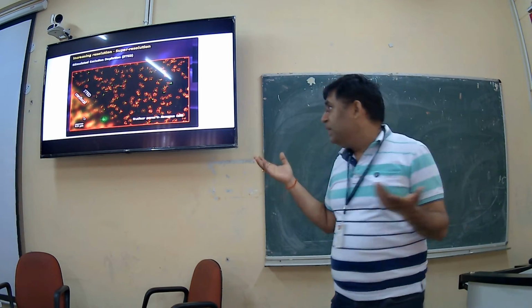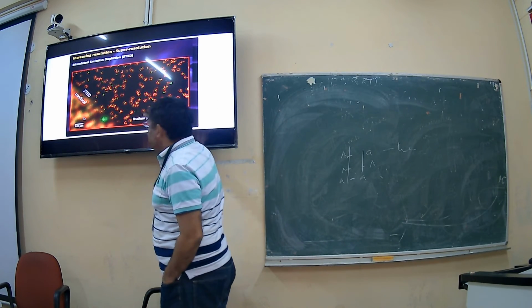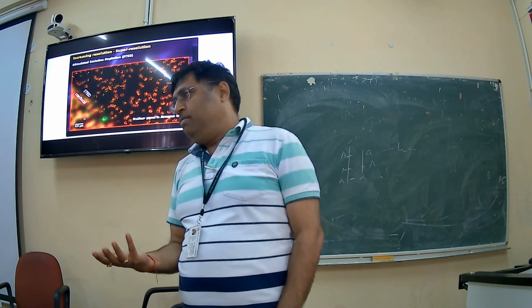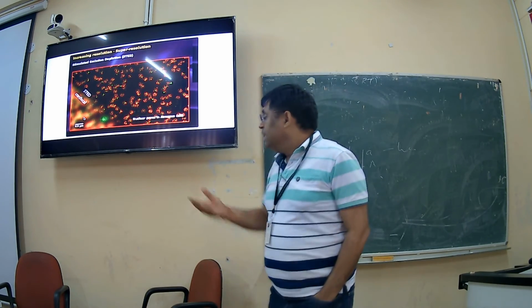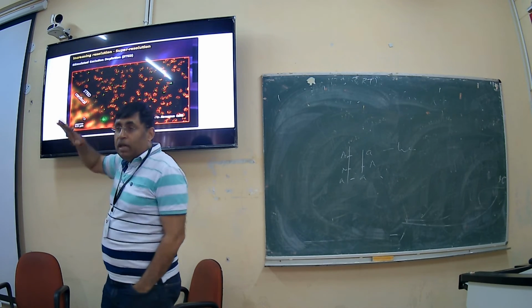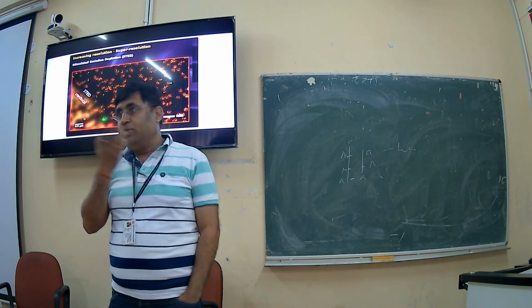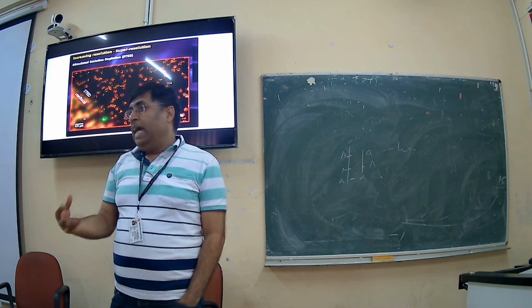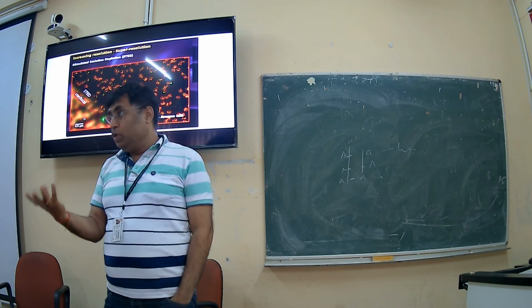So see again, this is the nuclear pore, where you can see the structure of the nucleus, and you can clearly see the nuclear pore. So you can study the science in a better way. And this is the confocal image. Confocal is a lot more advanced in comparison to fluorescent. I showed you one picture of mine taken with the fluorescent microscope and with the confocal as well, and there you saw the confocal was too good.